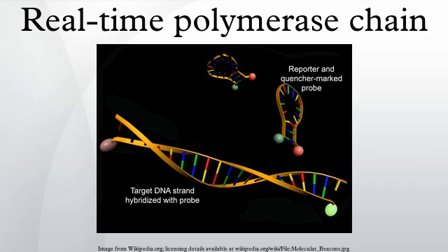A substance marked with a fluorophore is added to this mixture in a thermal cycler that contains sensors for measuring the fluorescence of the fluorophore after it has been excited at the required wavelength, allowing the generation rate to be measured for one or more specific products. This allows the rate of generation of the amplified product to be measured at each PCR cycle. The data thus generated can be analyzed by computer software to calculate relative gene expression in several samples.